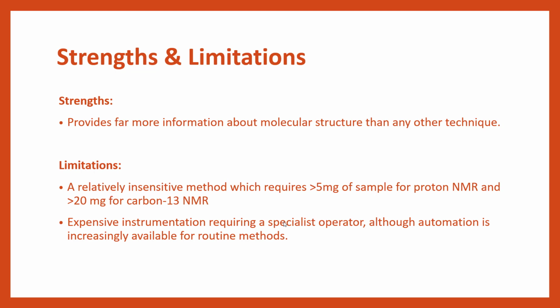The instrumentation itself is expensive, and typically you need to have a dedicated operator for it. So a technician who knows all about NMR, who is capable of running things like DEPTs, COSYs, HSQCs, and anything that may be a bit more technically advanced. There is increased automation, which is great, but definitely you always want a technician or an operator who knows what they're doing with an NMR.